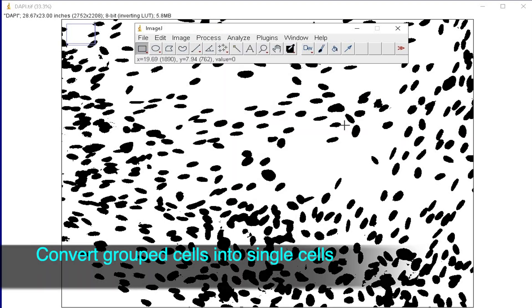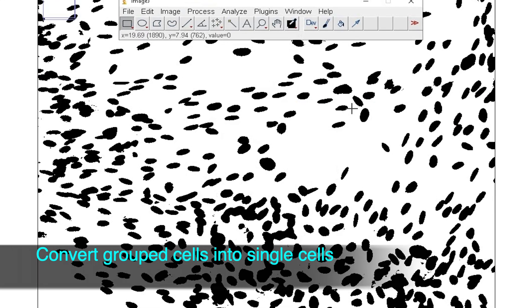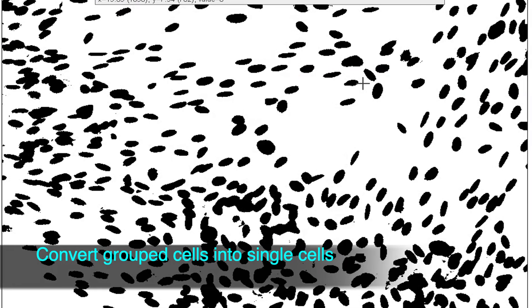To count the number of cells successfully, it is important to single out the cells that are fused together in a group. For example, in this image, there are many cells that have been clustered together.